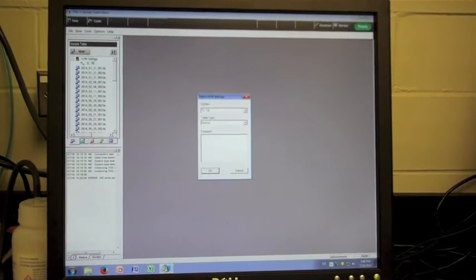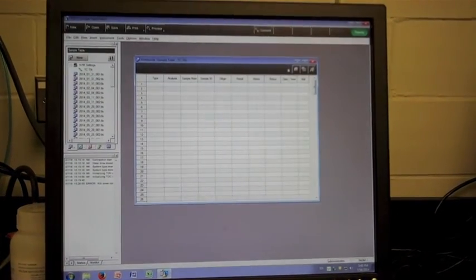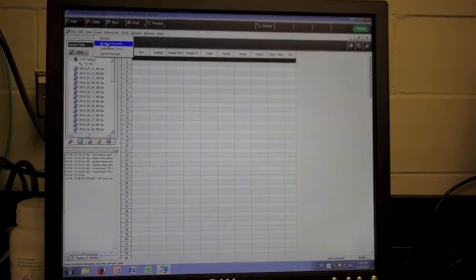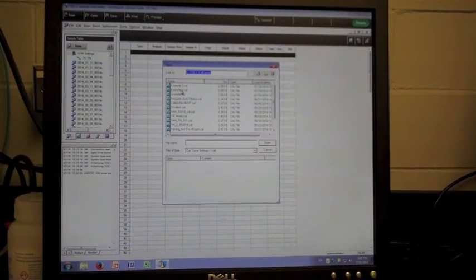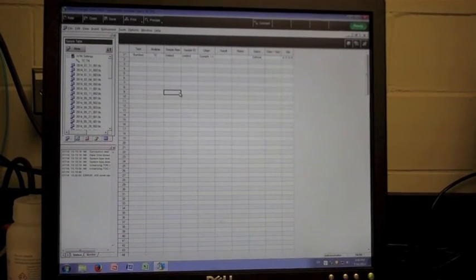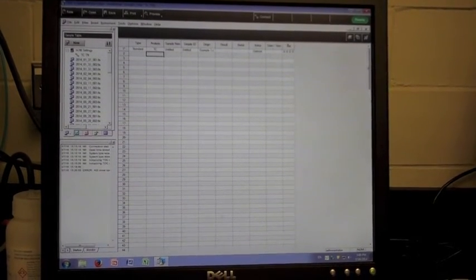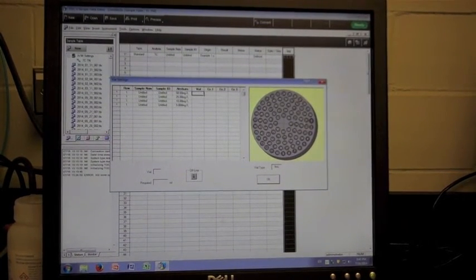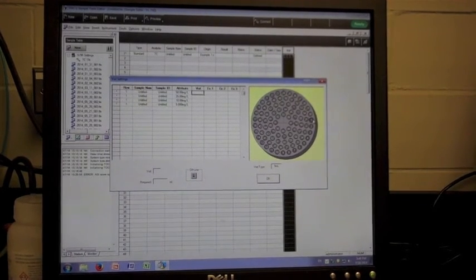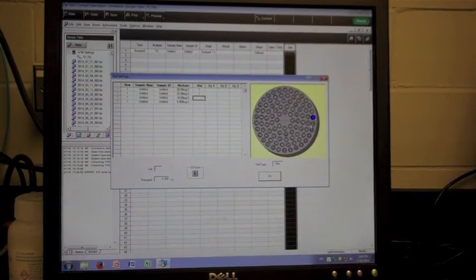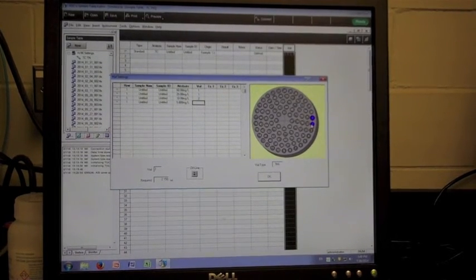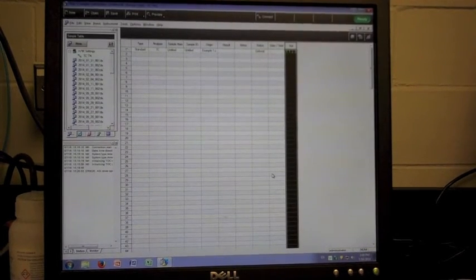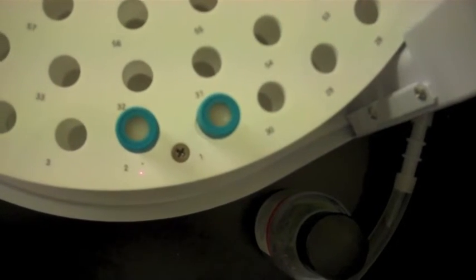Inserting the autodilution calibration into a sample table follows the same procedure. However, when inserting an autodilution calibration from one known standard, the vials do not have to correspond with each dilution. Instead, place enough vials into the tray so the machine has enough of the single known standard to dilute from. When making calibration curves from five dilutions, using about two test tubes is usually sufficient to ensure enough standard is available. Make sure those vials correspond with the assignments in the program.